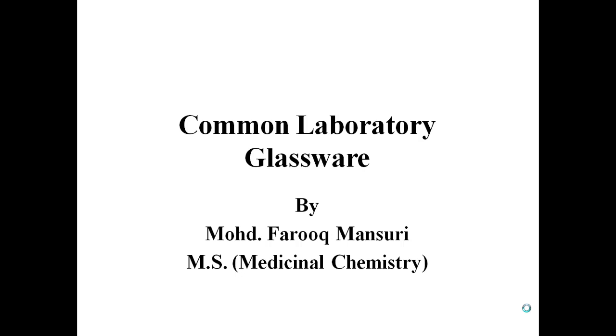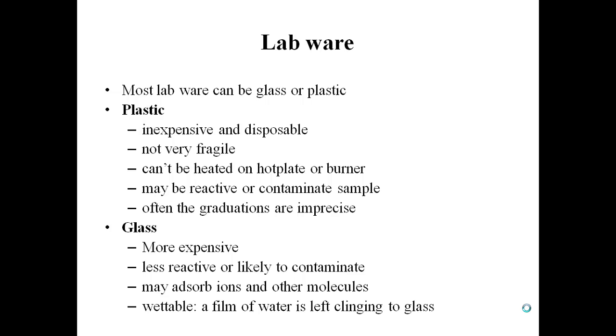Let's begin with the topic common laboratory glassware. Most of the labware is generally made up of two types of material. One of them is plastic and another one is glass. Plastic is inexpensive and disposable, but it can't be heated on a hot plate or burner, and it may be reactive or contaminate the sample. That's why we generally use less reactive glass labware.